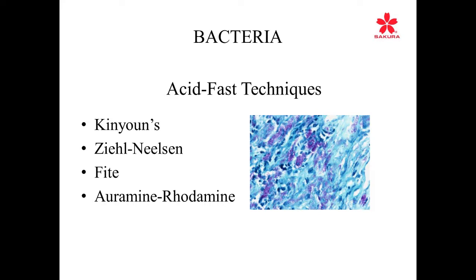But some of the other organisms, such as leprosy, well, some of the larger organisms would be like tuberculosis. Huge lipid layer, very easy to do with these types of staining techniques. Now, the Fite method is more designed for things like leprosy, which is a much thinner organism, which has a much thinner lipid layer, which can easily be decolorized out.